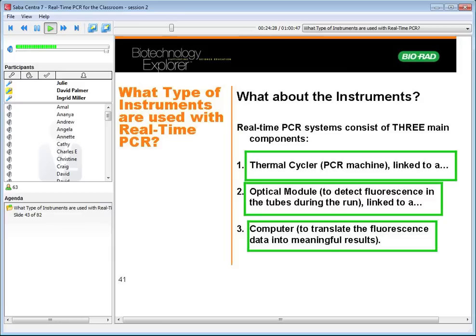Commonly, these melt curves will be presented as the derivative of the slope. So instead of the graph on the left, as I showed originally, if you plot the slope versus temperature, you'll end up with a trace that looks like chromatograms. And that's a lot easier to interpret.